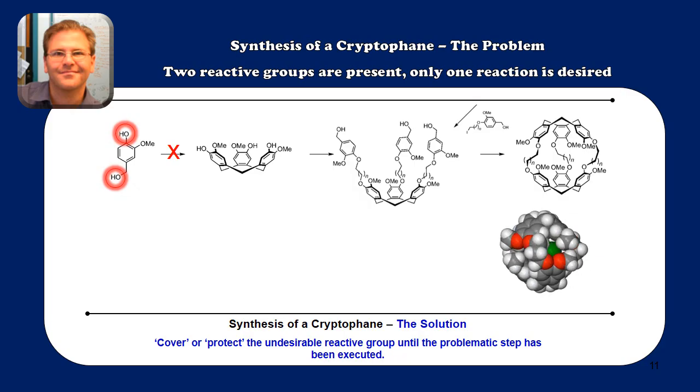In the research labs of Professor Holman here at Georgetown University, compounds known as cryptophanes are being synthesized. Cryptophanes are these large organic molecules. They look like this, and they can be created to encapsulate very specific atoms, ions, or even small molecules, acting as a sort of selective sponge to draw a desired substance out of a mixture. It's some fascinating research, and creating these cryptophanes is not a trivial matter.